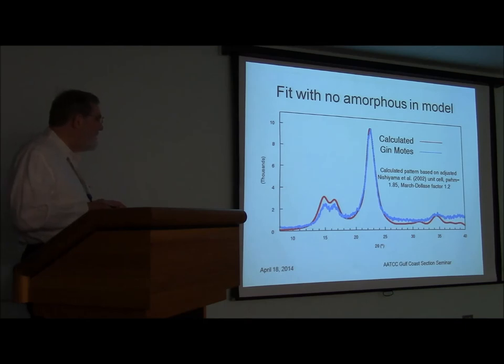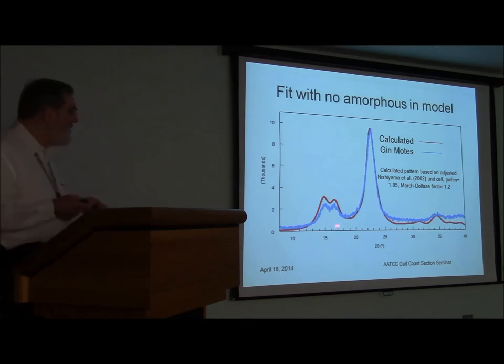So it's not clear that we're doing at all poorly in being able to fit this, then we know what information to use to calculate the size of a crystal that we might be looking at.